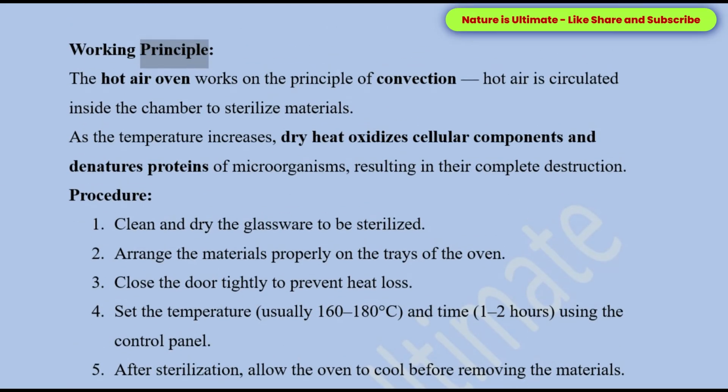Working principle. The hot air oven works on the principle of convection. Hot air is circulated inside the chamber to sterilize materials. As the temperature increases, dry heat oxidizes cellular components and denatures proteins of microorganisms, resulting in their complete destruction.